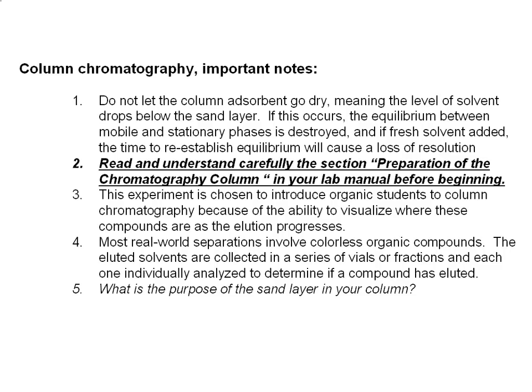That means the level of the solvent drops below your sand layer. If that occurs, the equilibrium between the mobile and stationary phases is going to be destroyed. And then if you try to add fresh solvent again, it's going to take time to reestablish equilibrium, and by that time you may have lost some resolution, or your separating power.